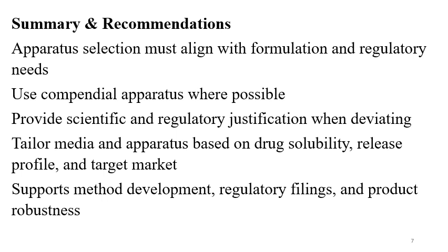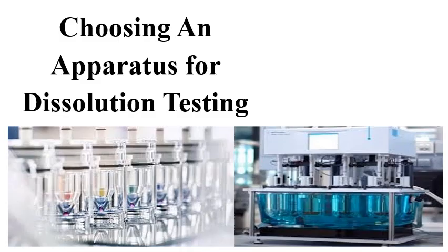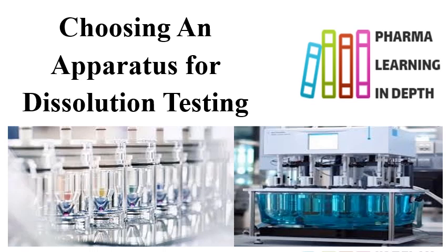Also, you should try basket apparatus for the capsule formulation, and check the release behavior in the same media with the two different apparatus. This will help you to understand the rationale and science behind selecting the dissolution apparatus.